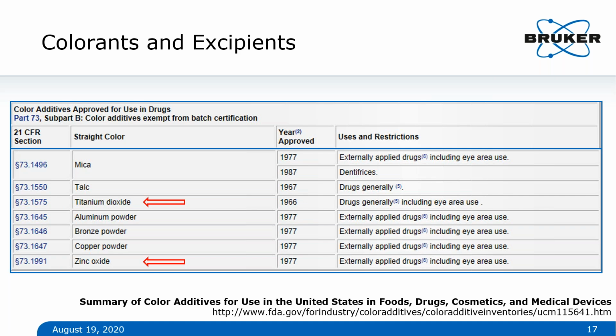So if you're looking at inorganic sunscreens, you frequently see that these have either zinc oxide or titanium dioxide. A lot of whiteners in, say, pill formulations or paint pigments or paper pigments rely very heavily on titania or titanium dioxide. So if you have a very nice white pill, this may be made more white by predominantly titanium dioxide.